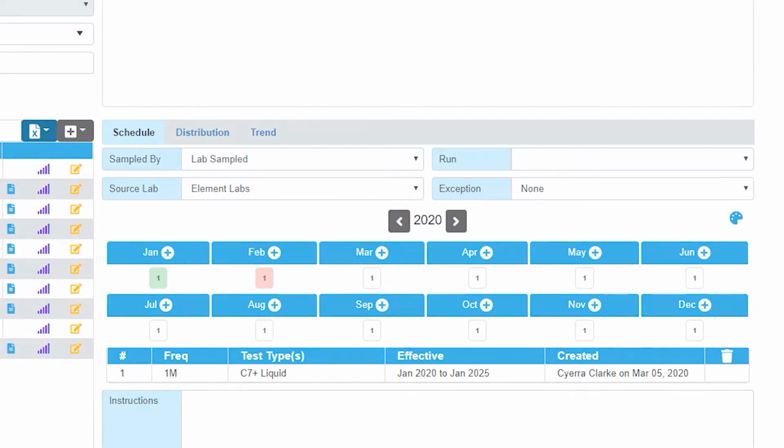When the schedules have been created, ProTrend can track all outstanding calibration and sample requirements through the reporting tool. Not only can we track this data, we can also automatically distribute it to avoid any lengthy email feeds and missed attachments. This will help to ensure that your schedules are compliant and avoid any non-compliance penalties.